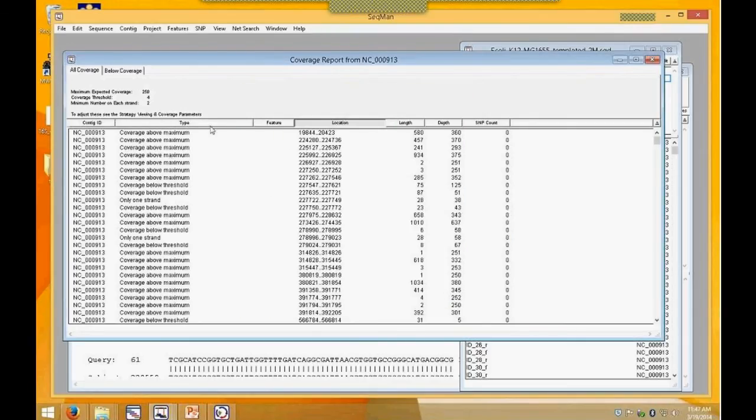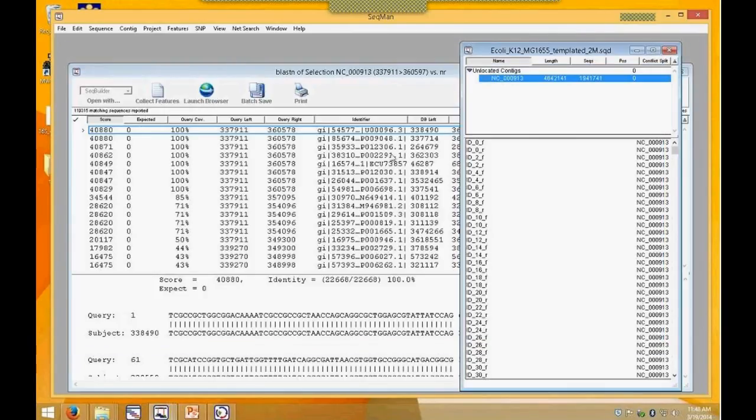And when I export the consensus to our SeqBuilder program, these locations will be annotated as feature types. Okay, so that's manual addition, blast, coverage features, and then there's the transfer over.